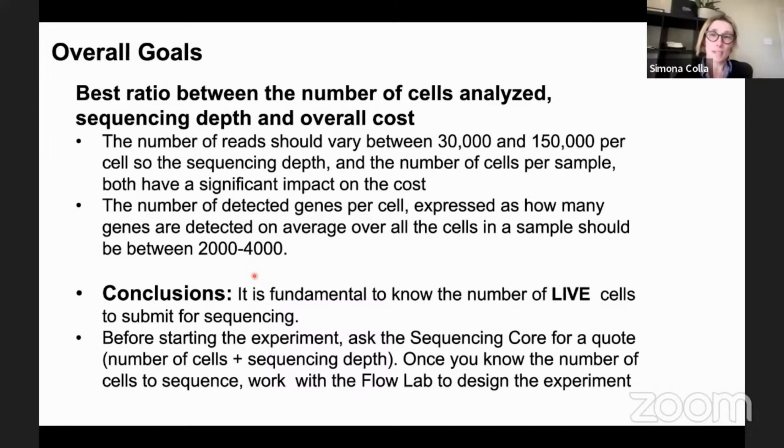The most important thing to remember is that first, you need to sequence at enough depth, and enough depth means you need to capture enough genes in the cell.